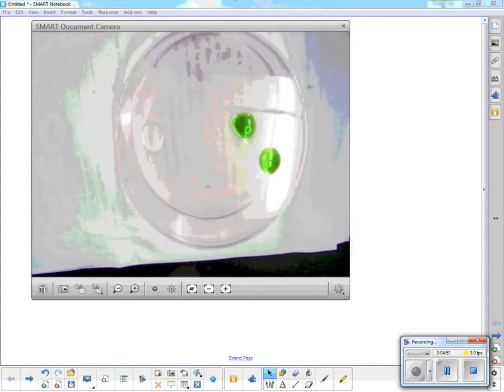Now you'll notice as we go here that the inside indicator will start changing color. As it starts changing color, you and your partner need to decide when you're going to call it. So when it has a full yellow ring around it, when that ring turns to orange, when the whole thing turns to bright red-orange, when are you going to decide that you are going to stop this? So you're going to time it. So again, this one can be used in concentration and temperature.